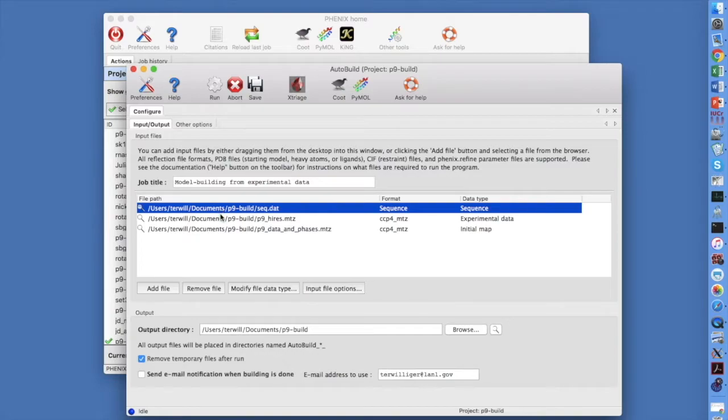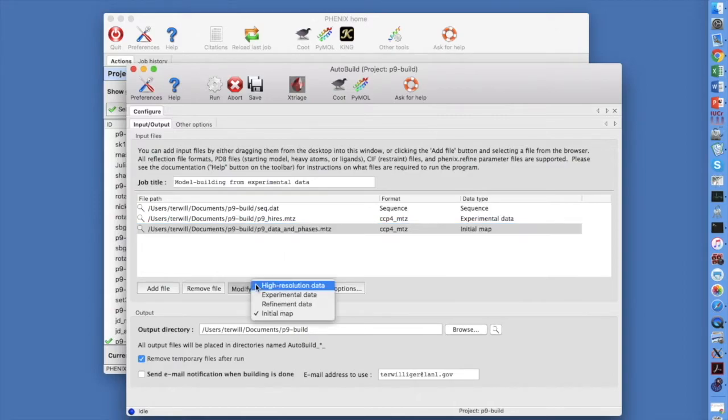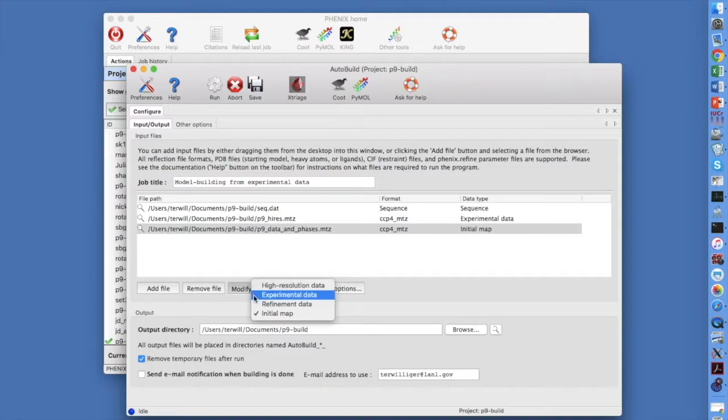Select the P9DataandPhases.mtz data file. The GUI incorrectly guessed it is an initial map. Click on Modify File Data Type to fix this.